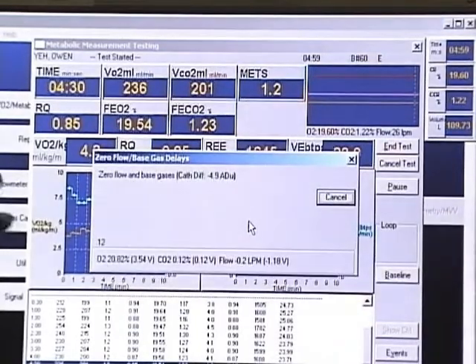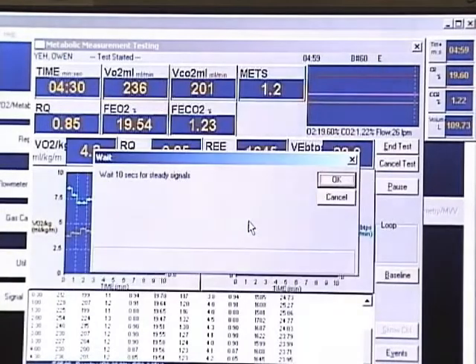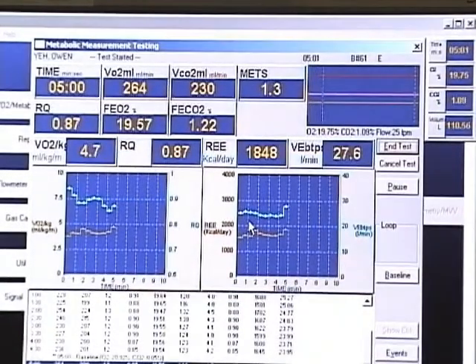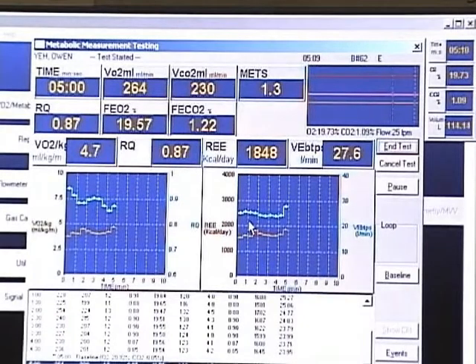And right now, I set the system to resample the baseline every 5 minutes so that we can correct for the drift of the analyzer. The whole room air recalibration process takes 30 seconds. And now CO2 is 1.08, 1.09, so our adjustment has some effect in diluting the CO2.